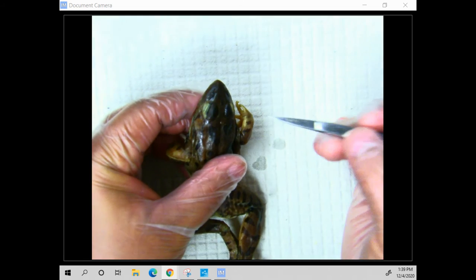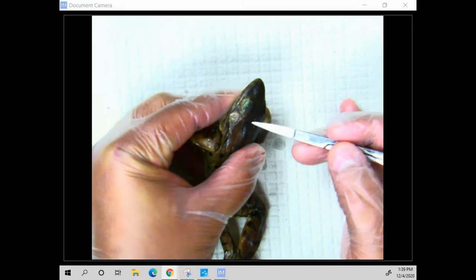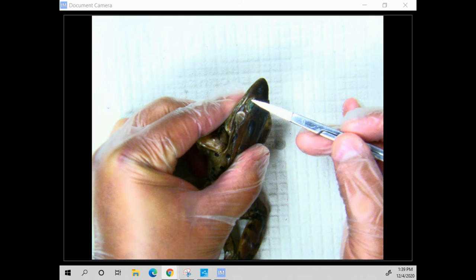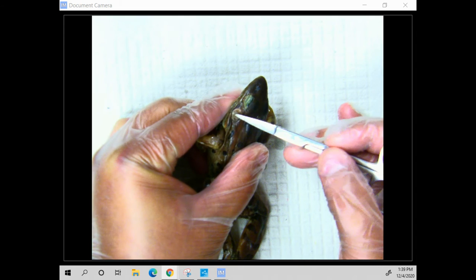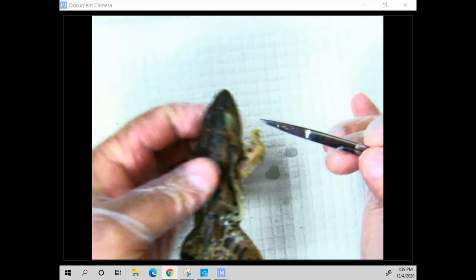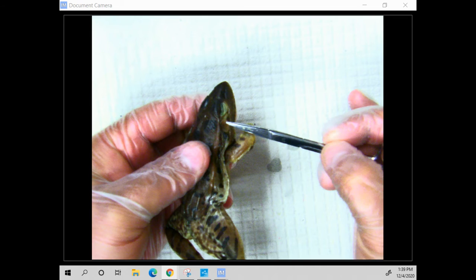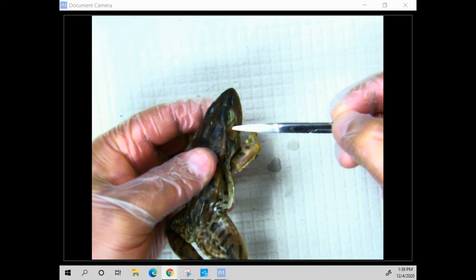After we've taken a look at the eye, we also notice that if this is the eye, there's another circular thing right here. You can kind of see that right there. And he has one again behind this eye. So here's the eye, and then here's that circular thing right around here.